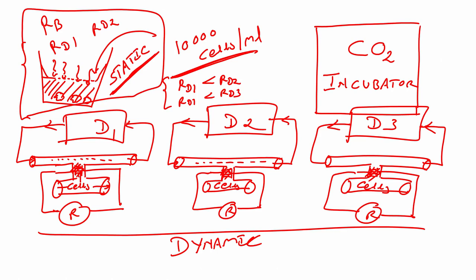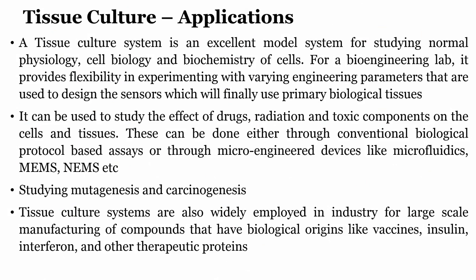You understand the difference? The dynamic platform would be better compared to a static platform for studying drug screening, since we can mimic the in vivo situation better in this particular case, as we are flowing the media instead of blood. We can also use blood and load the drug, and then you flow the drug into the Micro-fluidic chip. So, there can be multiple applications as well, okay. So, let us go to the next slide, and what we see, this is the applications.